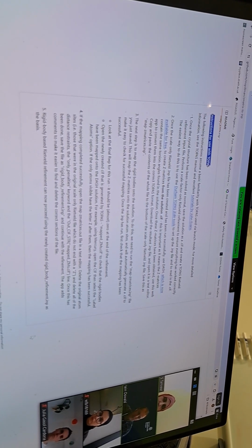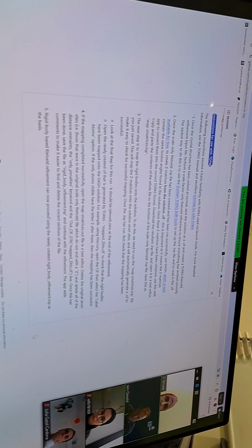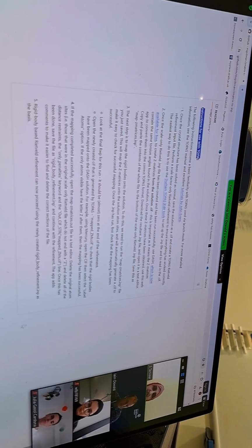Last time round we discussed how to get a Z matrix from DASH. Do you know how to do that, Sadia? I have used DASH, yeah.